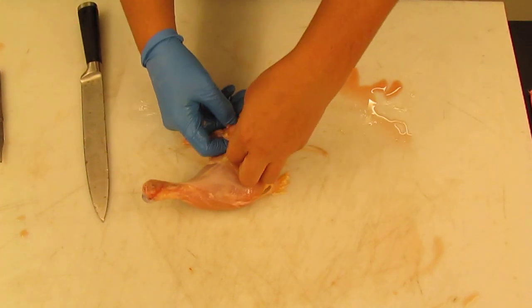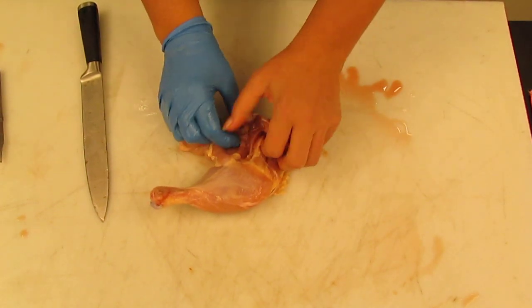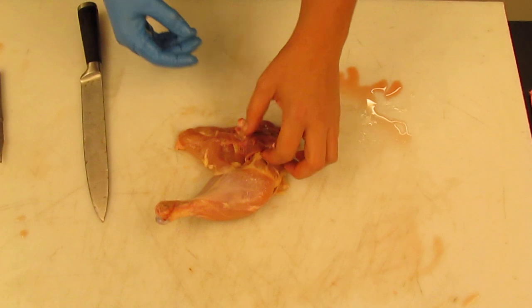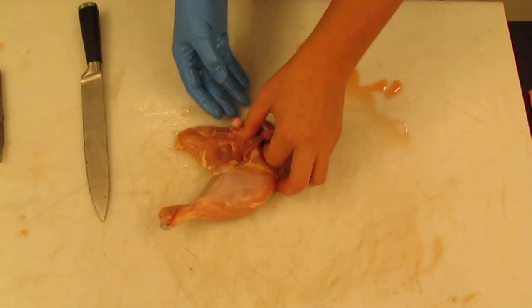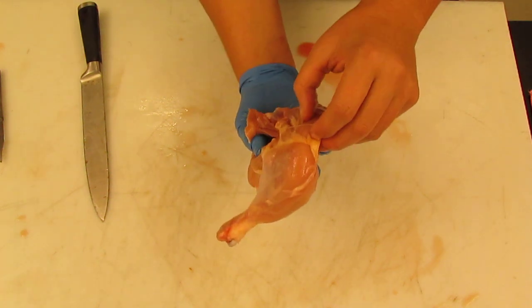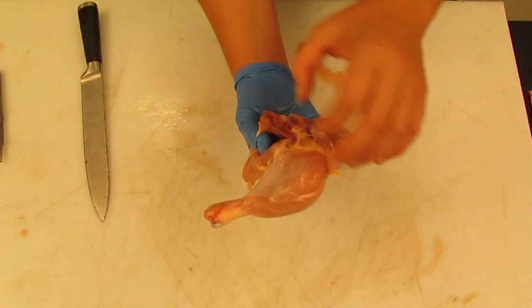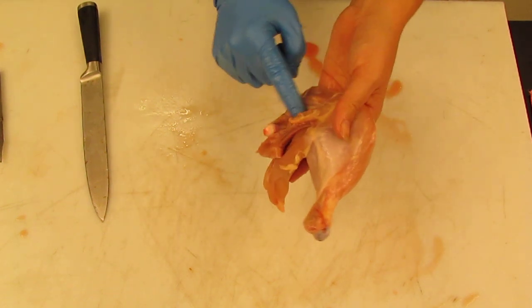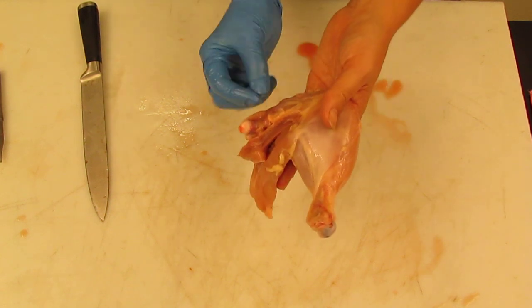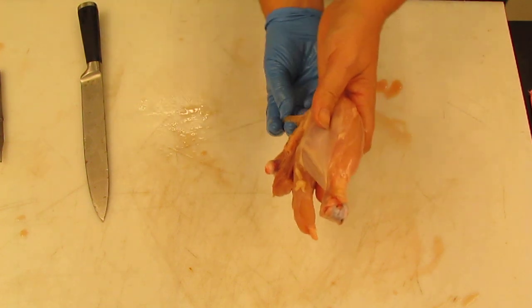All right. I actually have a quick question. Yeah, sure. So, would you repeat how to find the tendon again? Sure. I actually just found another one. Hooray. You're looking with your finger to separate the different muscles apart, right? And again, this should not take a knife, just because there are natural delineations between these muscles. If you look towards the end of a muscle, so for this one here, it just gets a little bit white and shiny towards the end. All right.